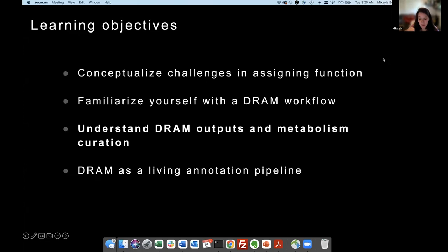If the question is, can you pull out 16S information from genomes? DRAM will do that. It uses a tool called Barrnap to synthesize that data out of your genome data, but this is strictly for assembly-based data. You can use it on assemblies or assembled genomes. And then the next one is, can DRAM be used for non-metagenomic data like individual bacterial genomes? And so from isolates, yes, from isolate genomes, you can definitely annotate your FASTAs with DRAM for that.